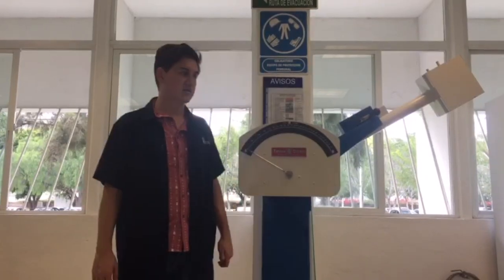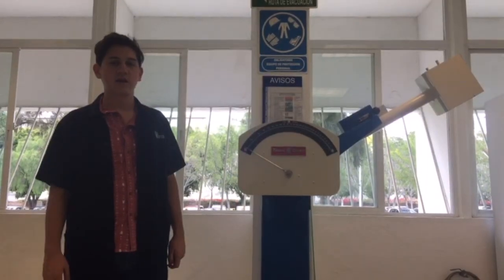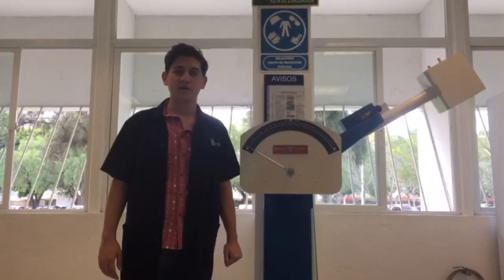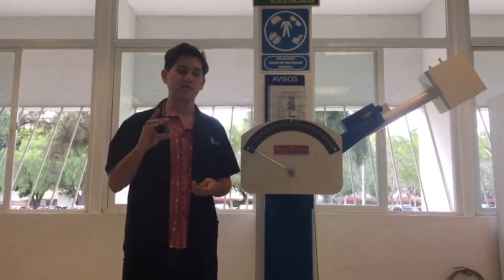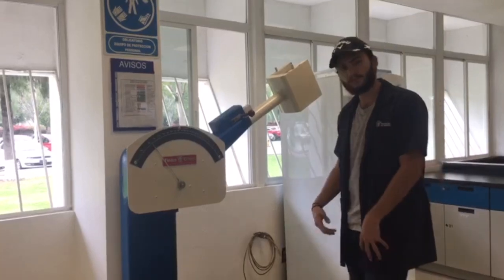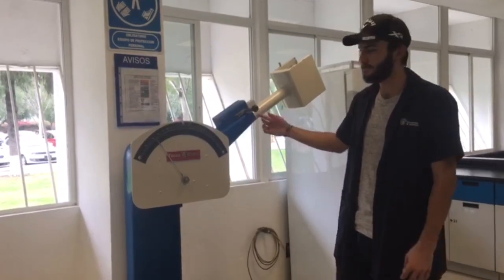The objective of this practice is to learn how to use the pendulum in order to normalize the Charpy impact tests with steel at different conditions and temperatures. For this test, we are going to use the pendulum. Before testing the actual sample, we need to calibrate it.